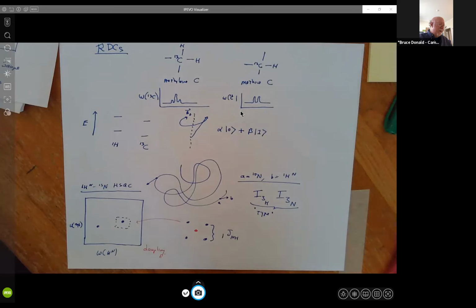Now, let's take a geometric view and ask, how does this relate to RDCs in some sense?